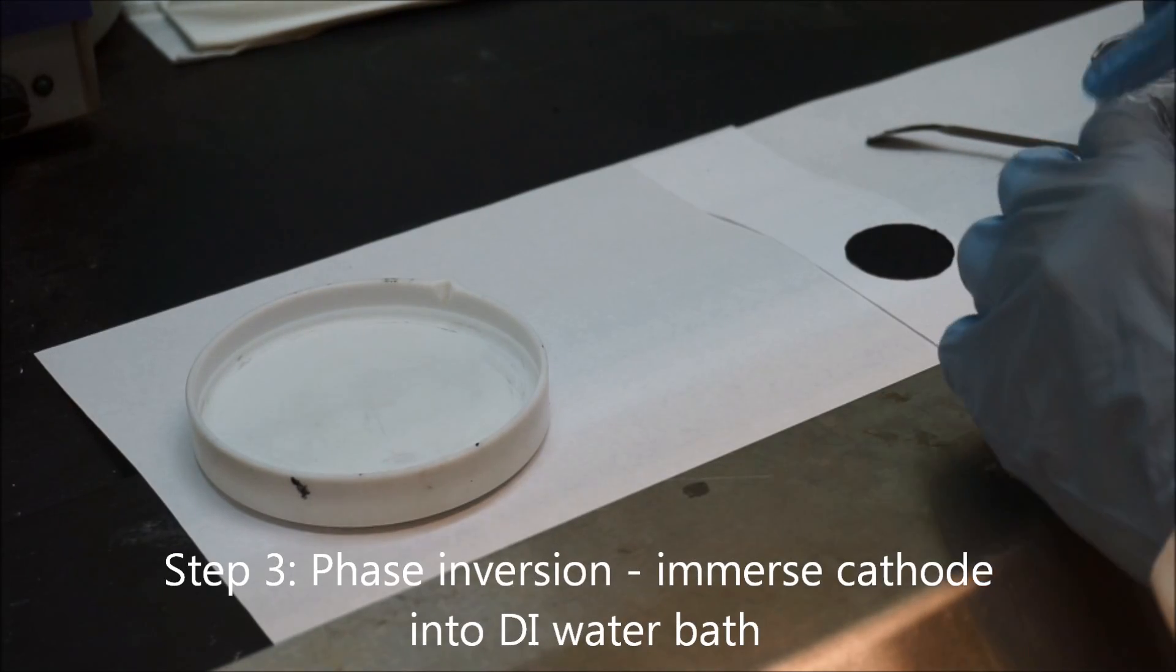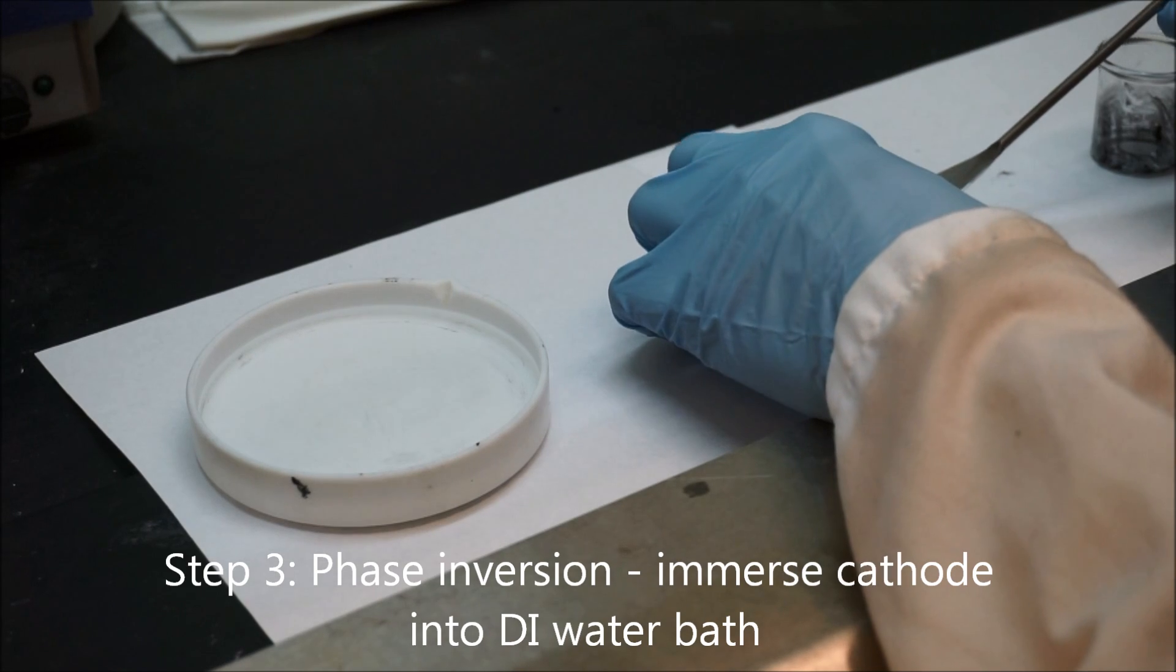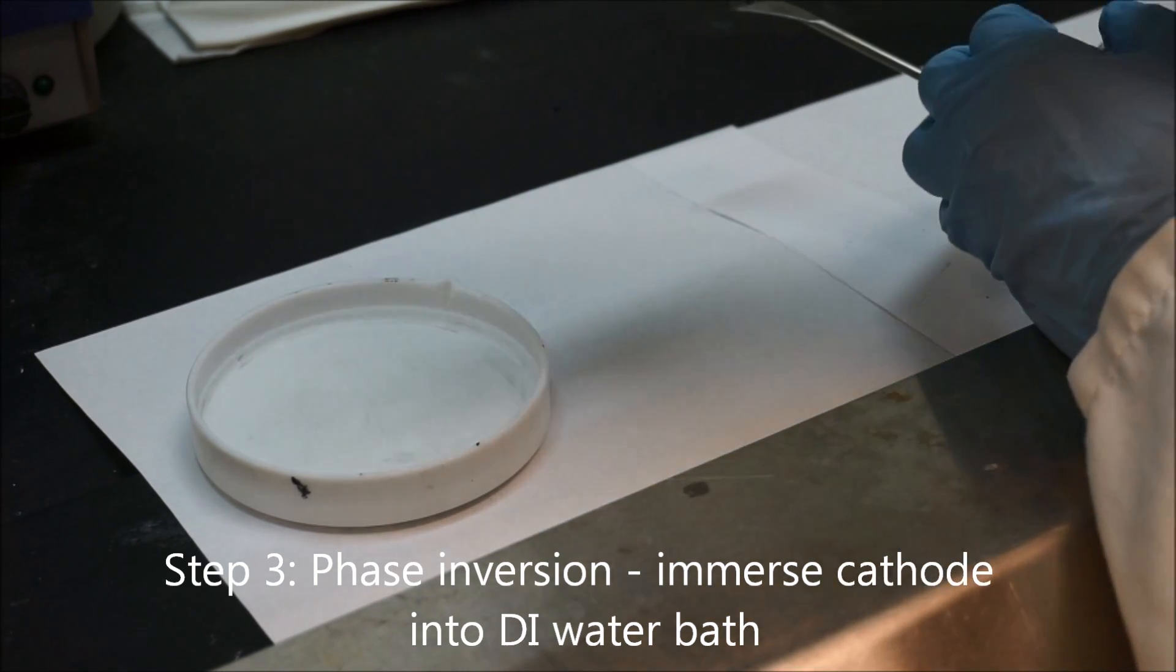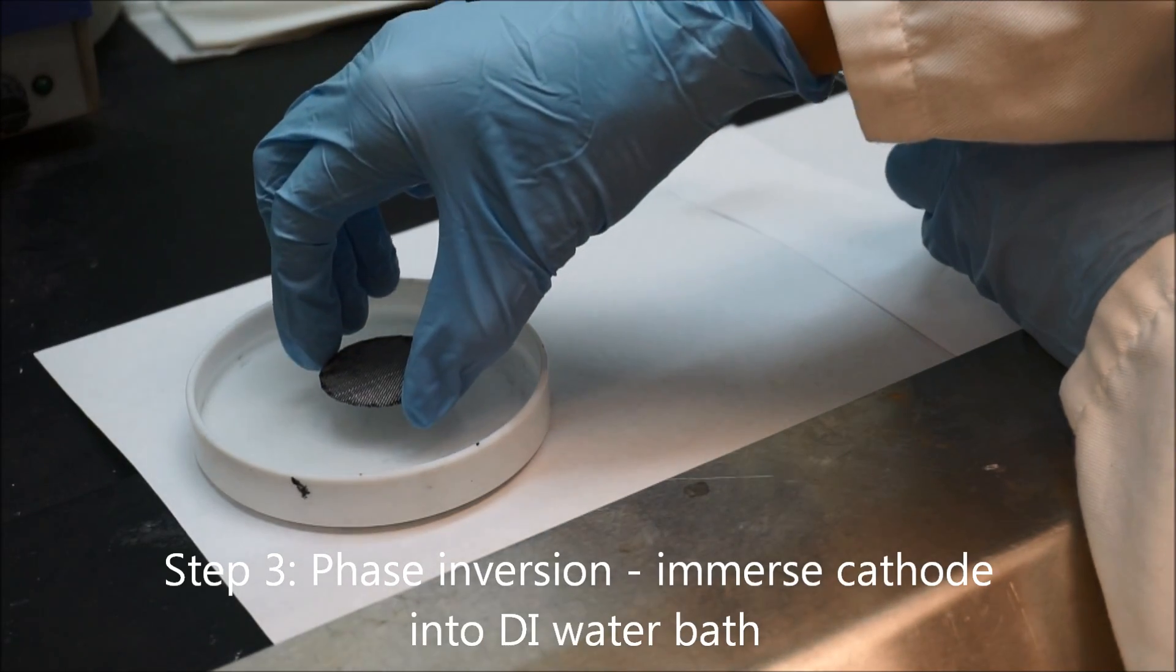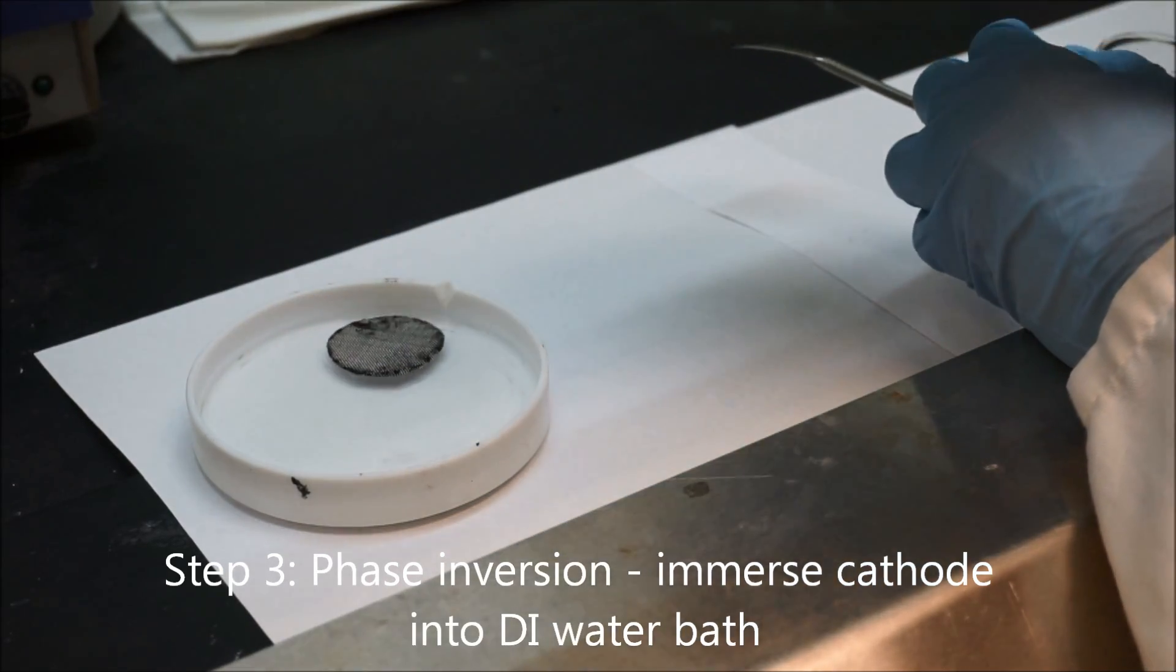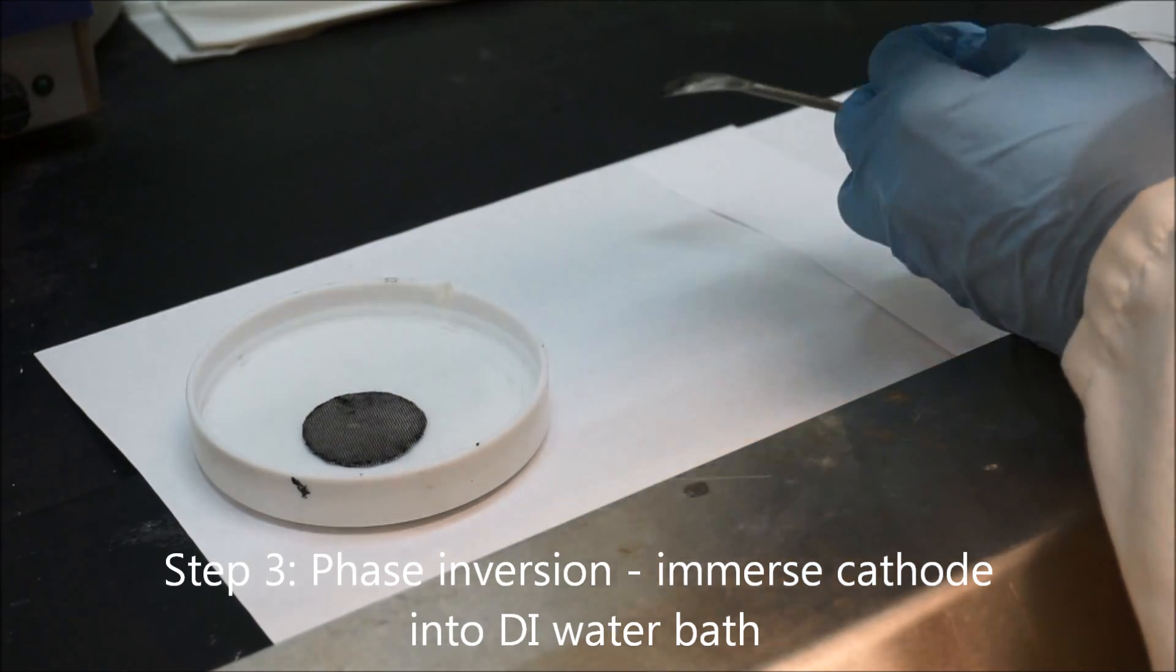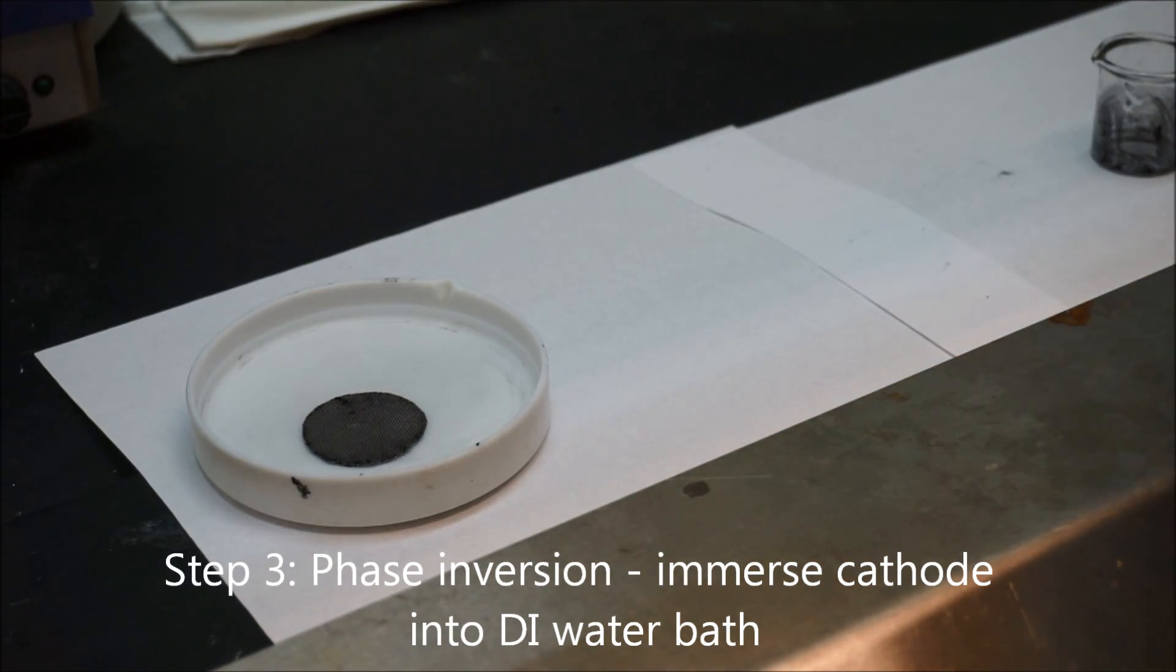After spreading the active carbon mixture onto the stainless steel mesh, the next step is to put the active carbon cathodes into the DI water bath to go through phase inversion process. Remember to put the active carbon mixture side towards the bottom and then leave the active carbon air cathode for 15 minutes.